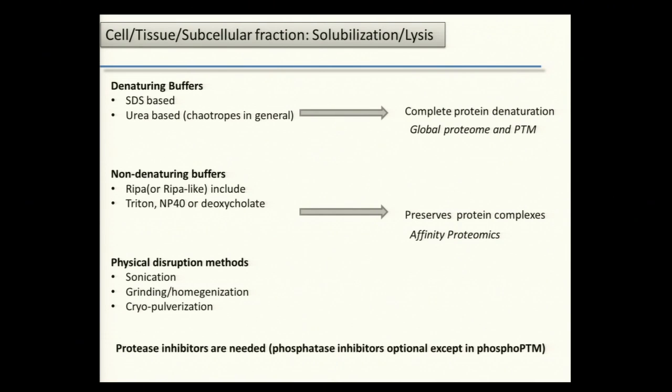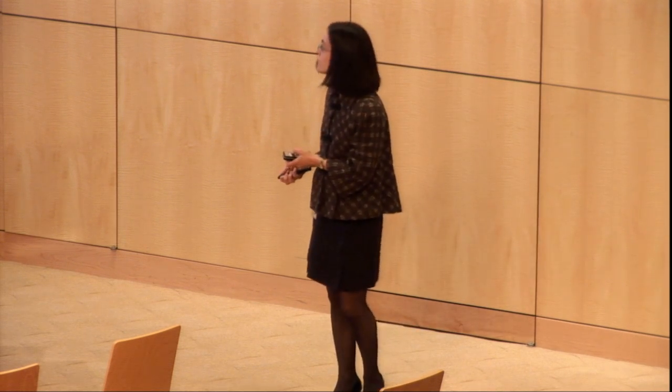Protease inhibitors, phosphatase inhibitors, proteasome inhibitors, protease inhibitors in general. So this is something that, again, is very dependent on what type of experiment you're doing. But the general idea is, remember, you're releasing a lot of enzymes when you break up your proteins.